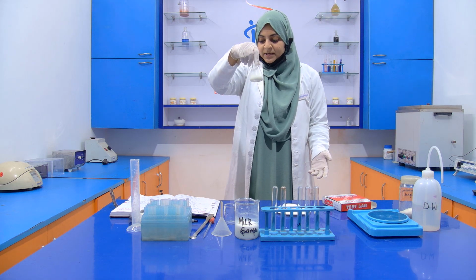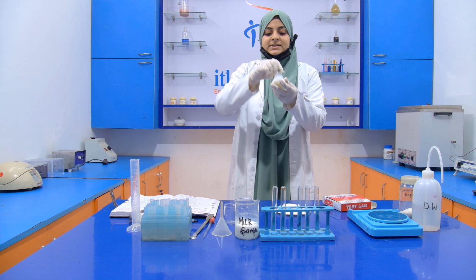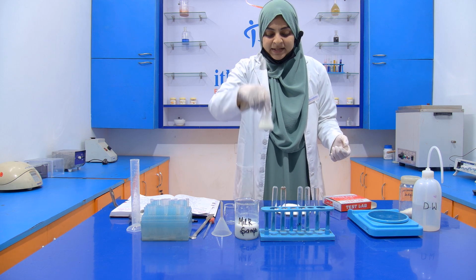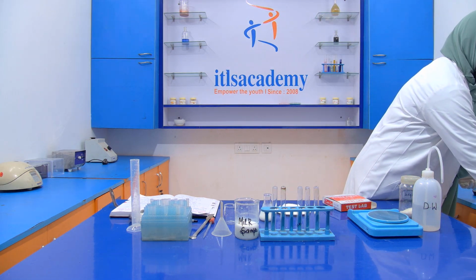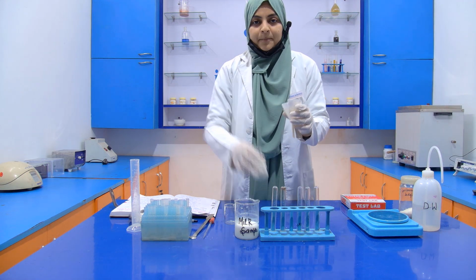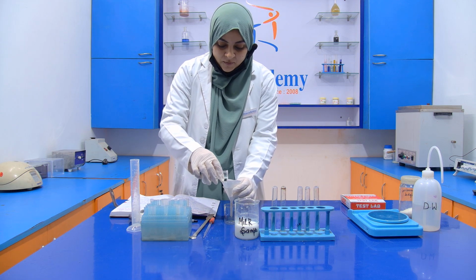Now after mixing for 1 minute, we have to keep this solution in a standby position for 5 minutes. Then we will see the result after 5 to 6 minutes. Now after keeping it in a standby position for 5 minutes, we have to filter it and take only the filtrate.